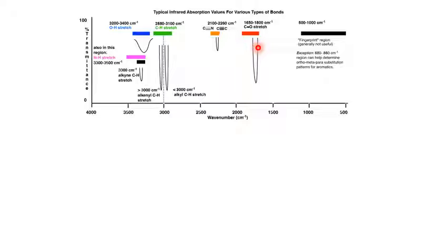The reason is that the change in polarity is higher compared to other functional groups, like the carbon-carbon triple bond or carbon-nitrogen triple bond. You will see that the band intensity is much lower than the CO stretching frequency, for the same reason: the extent of change in dipole moment is lesser here. Because of the same element, carbon-carbon, there is very little change in polarity, as the electronegativity difference is small for carbon-carbon and carbon-nitrogen also, whereas for carbon-oxygen the electronegativity difference is high. Therefore it gives the intense band because of the high polarity change during its vibrational mode.